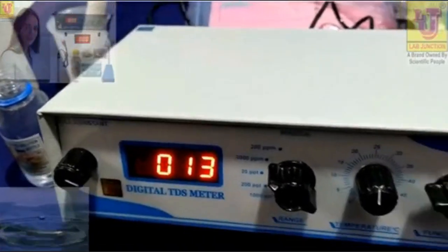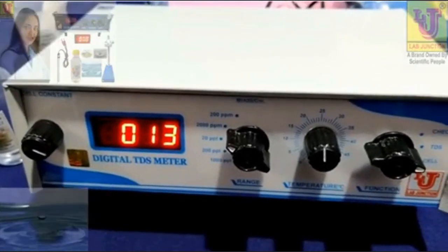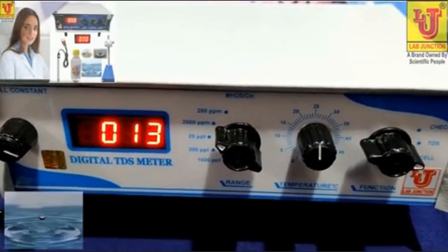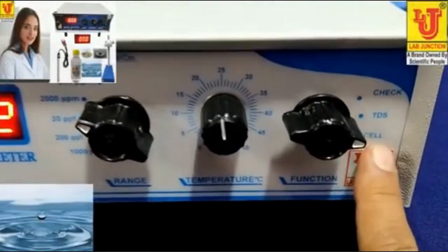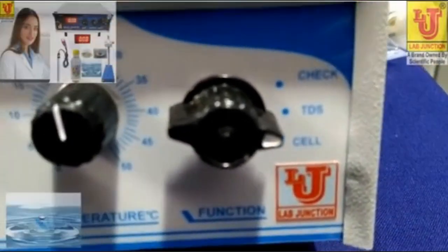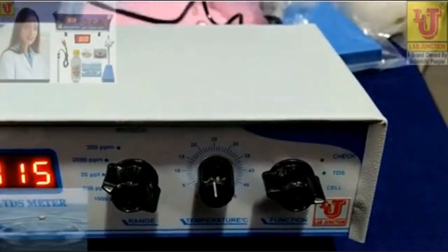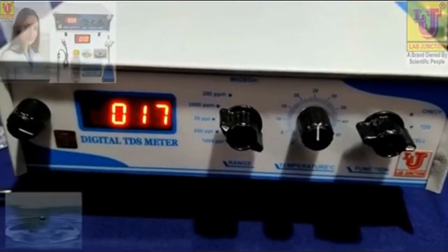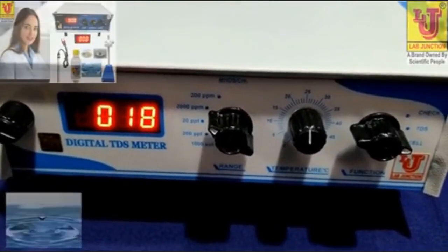Now one thing is more important in the digital TDS meter. What is this cell constant? Suppose you have to standardize on 650 ppm.